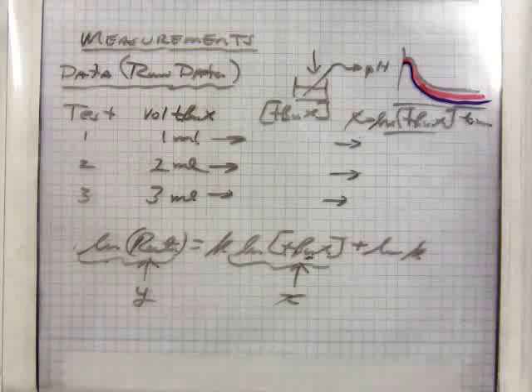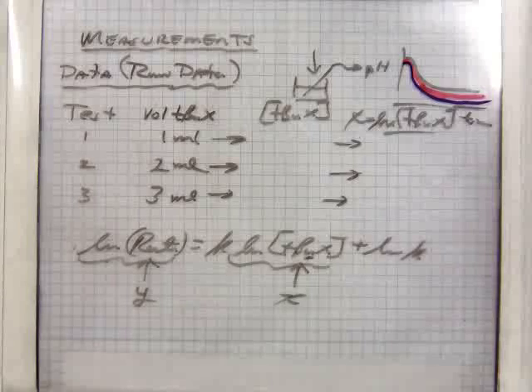And then you'll take 10 to the minus this number in here, 2.77 times 10 to the minus 3 molar, that's the molar concentration of your acid. That's 10 to the minus 2.588. This number is 10 to the minus 2.358 right there. That's that second one in here, the second curve at that 100. This thing will split those out pretty closely. And then the 3 mil injection would be the 10 to the minus 2.258. That's that one. That's the same as the T-butyl halide, so I'm just carrying it across.